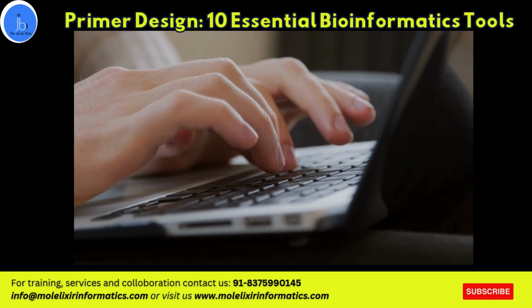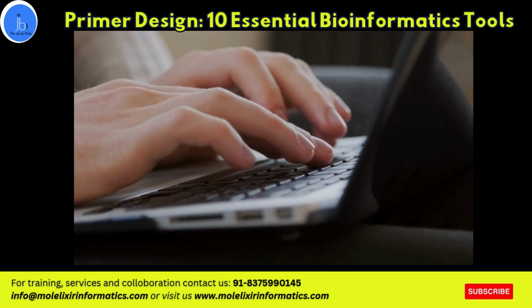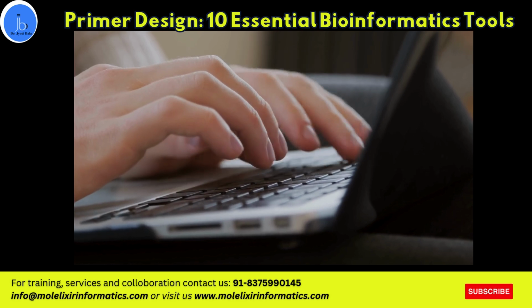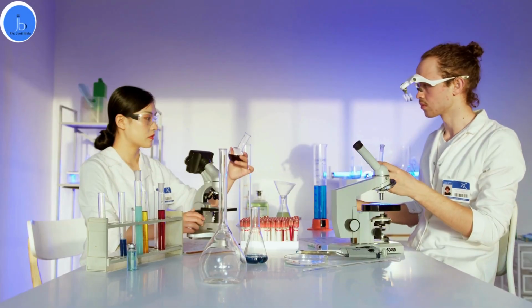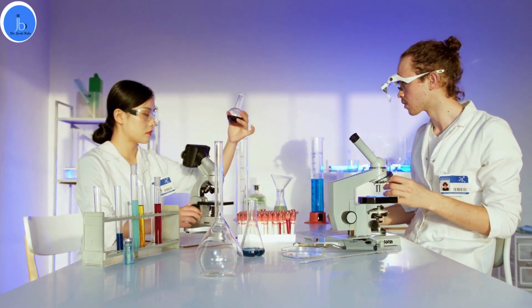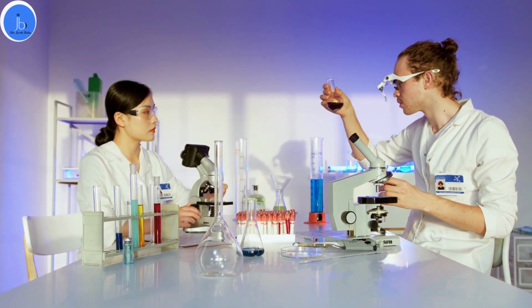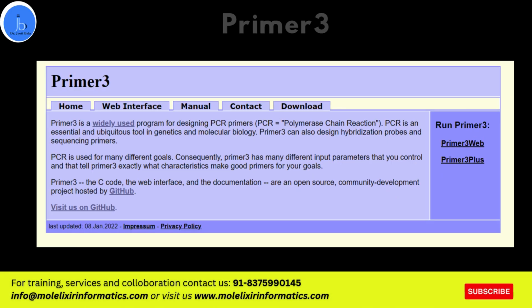In this session, we will be exploring some of the wonderful bioinformatics tools, especially those used in primer designing. As many of our participants are from a biotech and molecular biology background, along with bio IT, they often require these primer designing tools. So let's get started. The number one tool is Primer3. This one is used for designing PCR primers.